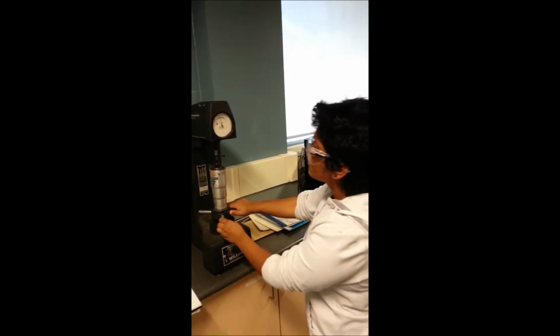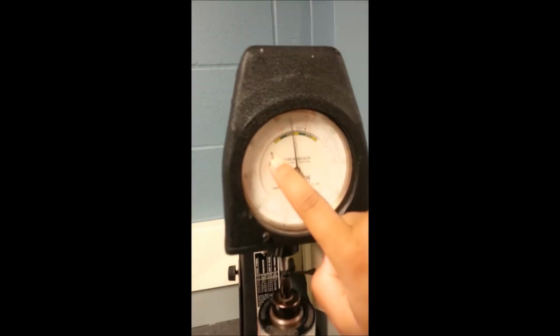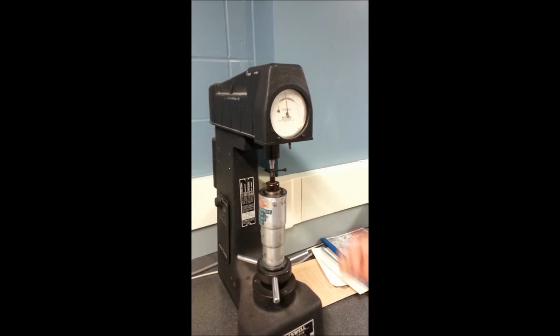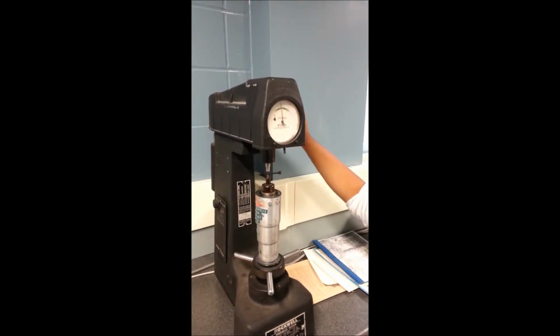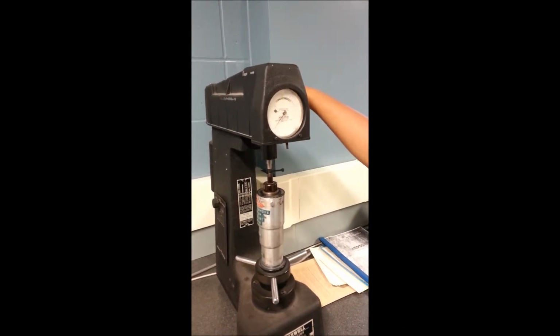We applied the minor load and zeroed the reading. We then applied the major load and waited for the needle to rest until we removed it.